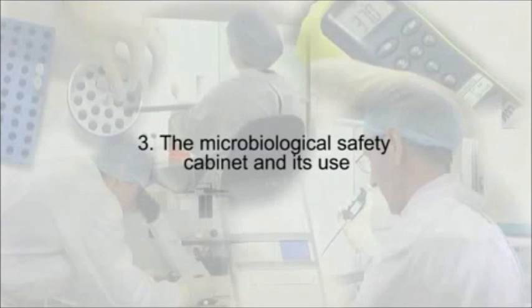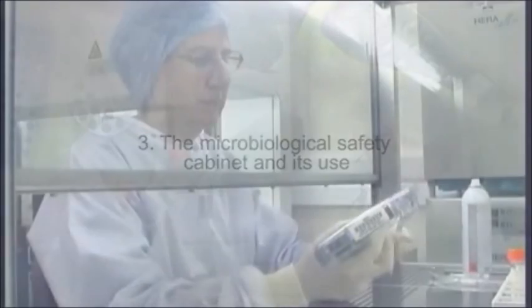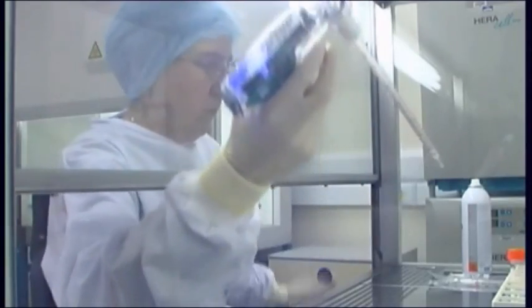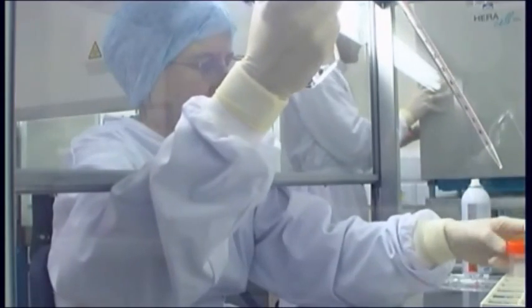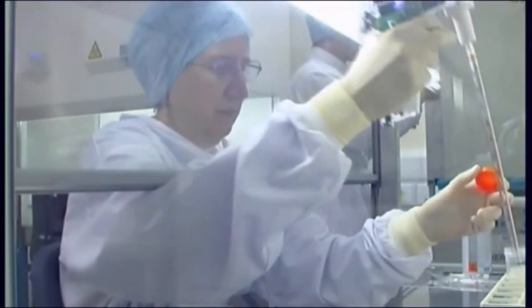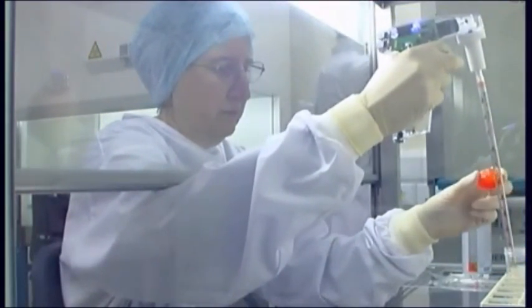The microbiological safety cabinet and its use. Working with cell cultures generates aerosols that pose an unseen threat to the scientist and co-workers. To protect against these threats, microbiological safety cabinets are used.